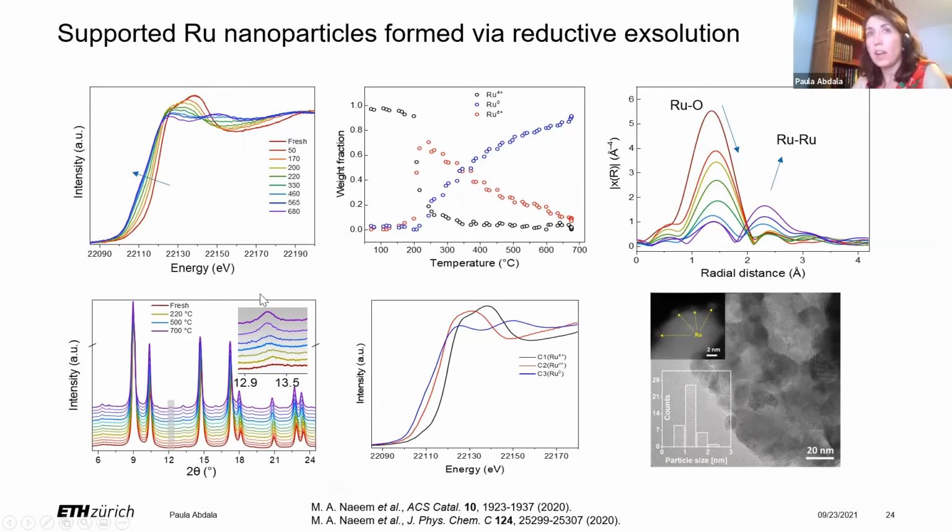The powder diffraction shows a disorder-order phase transition here, with ordering of the oxygen vacancies. And probably this plays a role in the exsolution of ruthenium out from the structure. The XAS, here we only look at qualitatively because it's done at different temperatures. This is ramping.